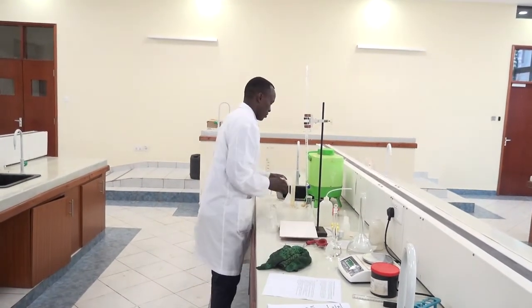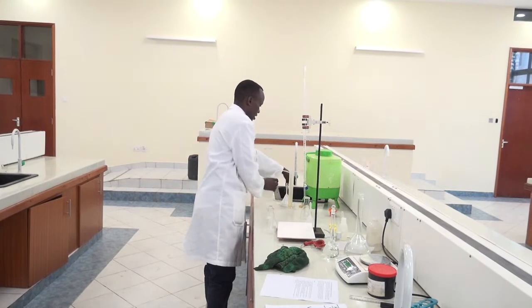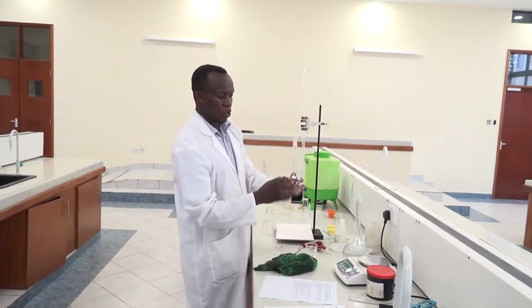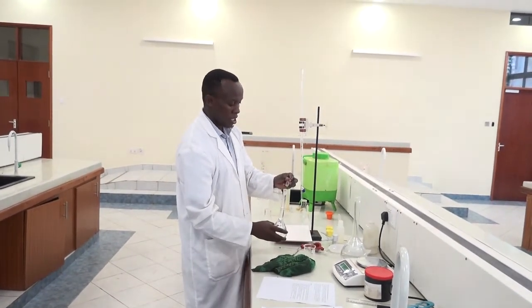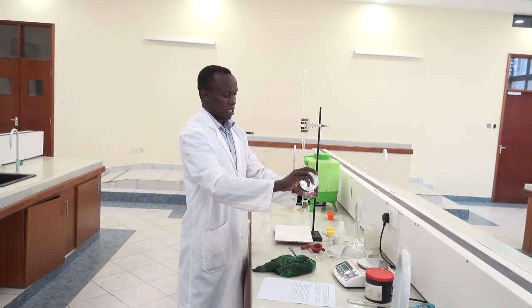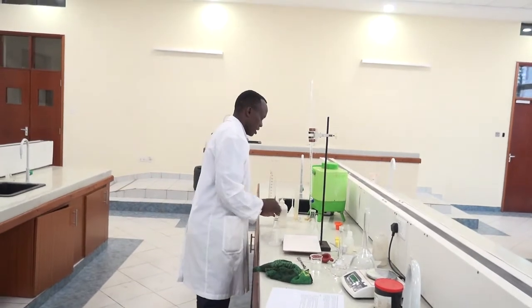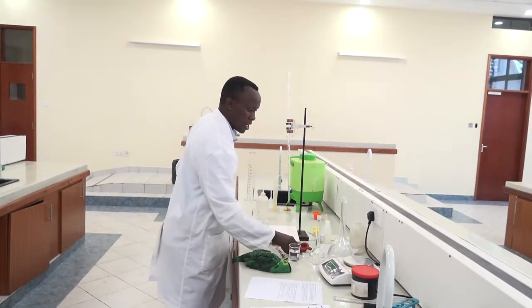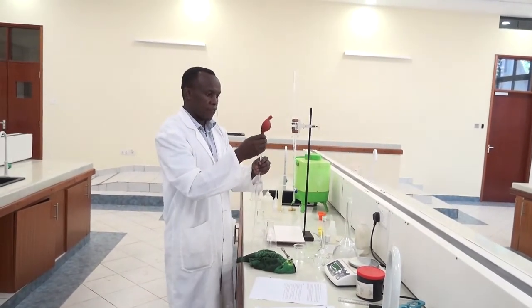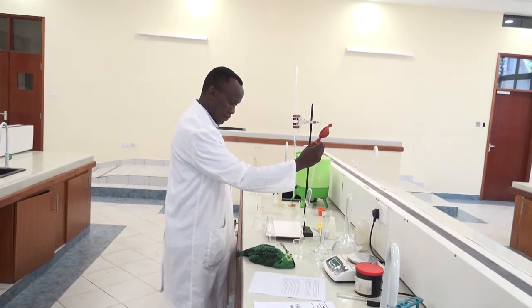Now I have to pipette my sodium hydroxide. This is my sodium hydroxide, whose concentration I'm intending to find using the concentration of the HCl. Now I just fill with the sodium hydroxide, and now I pipette 25 mLs using a 25 mL pipette and a pipette filler.